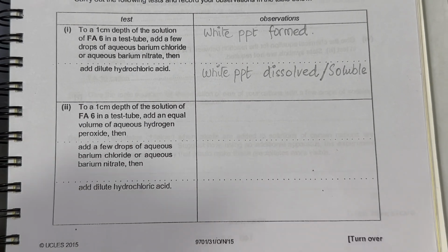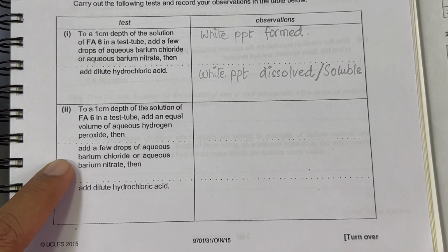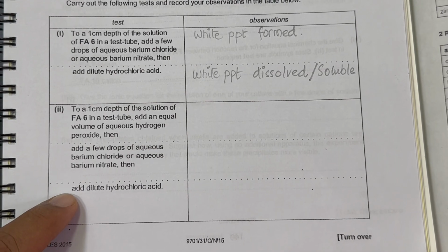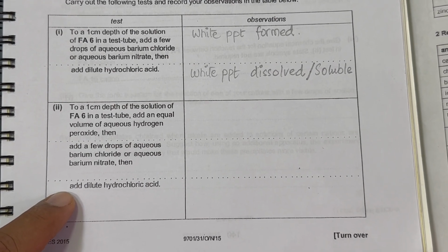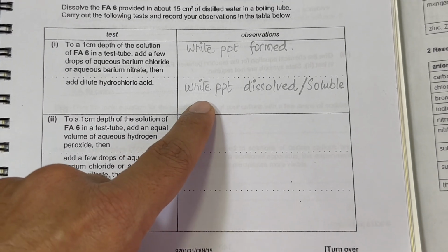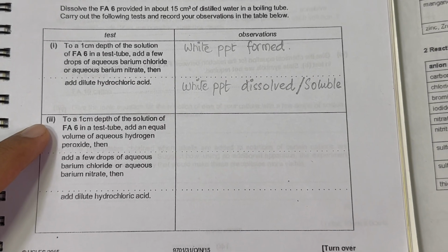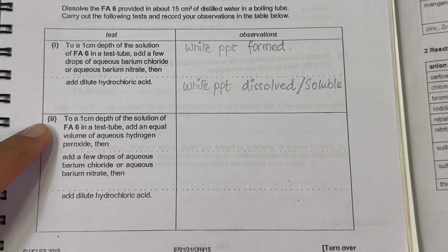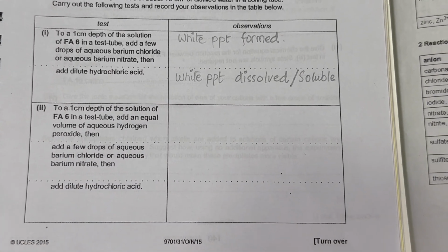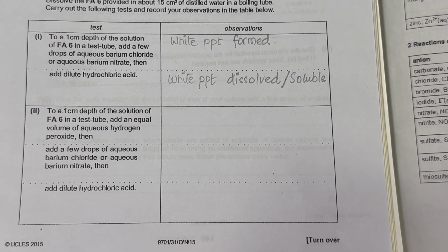And then in the same test tube, add a few drops of barium chloride or barium nitrate, then again in the same test tube, hydrochloric acid. It means if you have found sulfite in the first part, you are adding hydrogen peroxide so that the sulfite will oxidize and form sulfate. And then again you are testing sulfate with barium chloride followed by hydrochloric acid.